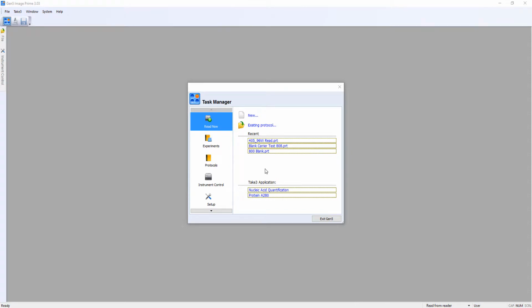My name is George and I'm a training specialist here at Biotech Instruments, and in this video we'll be discussing the Simulate Read mode. For training and educational purposes, we have a Simulate mode that will allow you to practice without being connected to a reader. This is a useful tool to test settings or to get a feel for how a procedure may behave or work when you are connected to an instrument.